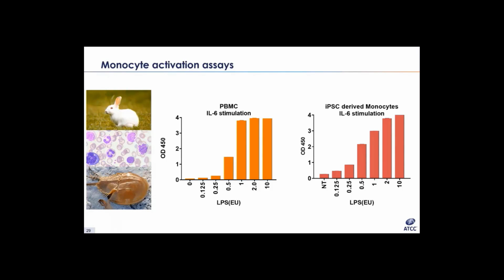So in recent years, there's been a movement away from using animal-based tests. A good example of this is the various tests for detecting endotoxins, aka pyrogens, in parenteral preparations and biologics. These compounds can cause a robust immune reaction and fever, followed by severe shock and death.